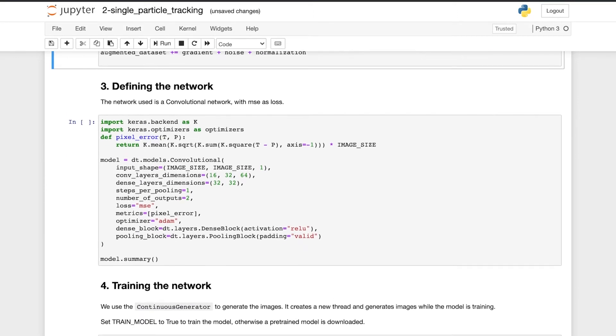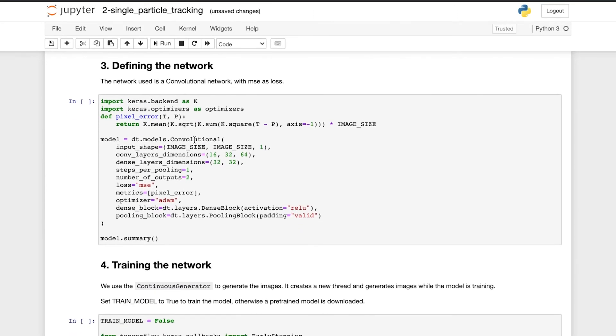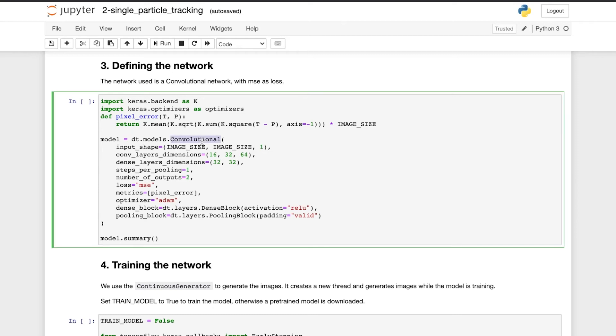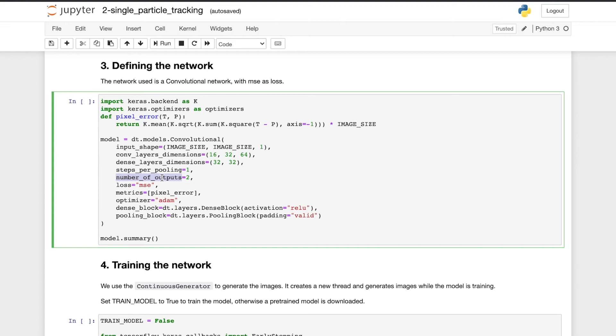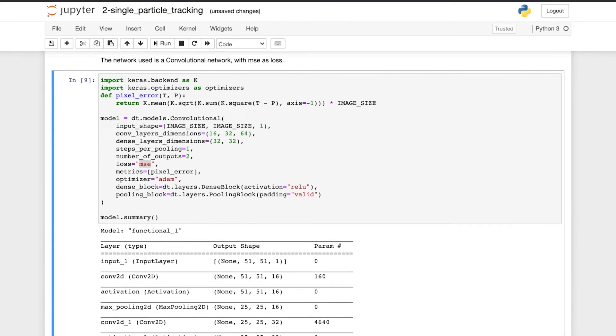Now that we have our training data set ready, we move on to the network. Here we use a convolutional neural network with three convolutional layers and two dense layers at the end, for two outputs, that is the x and y coordinates of the particle. And we use the mean square error to train the network. Here we can see the model summary.